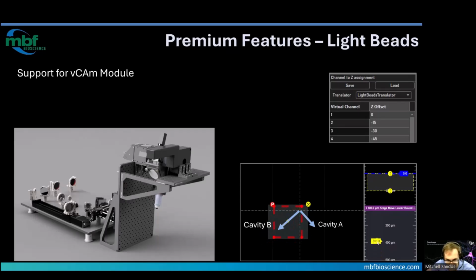There are some other special accommodations for accuracy of display, accounting for resonance scanning with uniform sampling of lines and a single laser pulse per pixel sampling strategy, but I won't delve into that here.